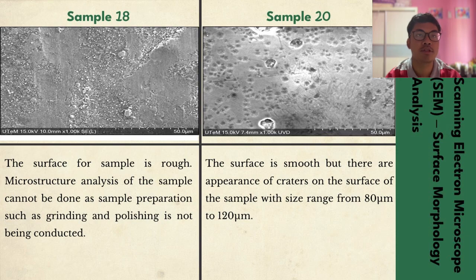To analyze the surface morphologies of the samples, a scanning electron microscope is being used. Surface morphology is a subset of analytical imaging, which is an advanced form of high spatial resolution imaging that uses sophisticated microscopes to produce images of products, samples, and objects that cannot be seen with the naked eye. Such images originate from the exposed surface of the sample or product.